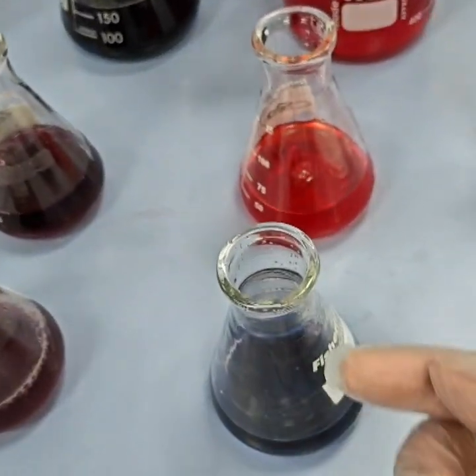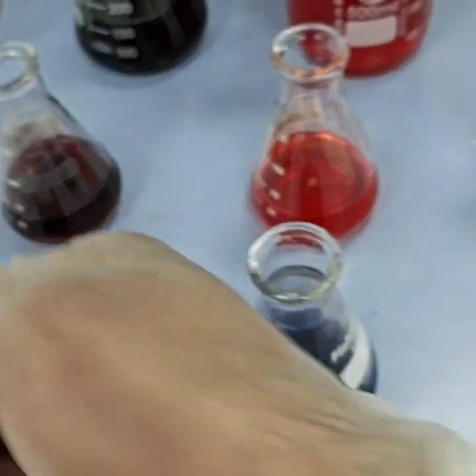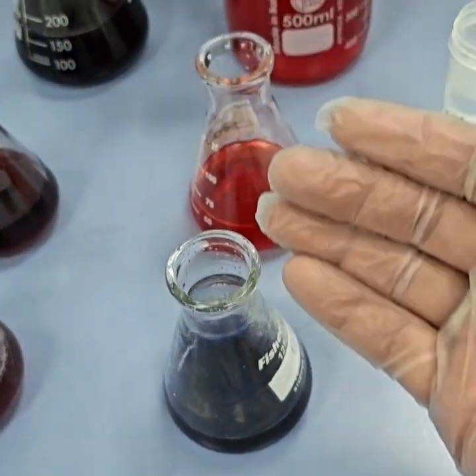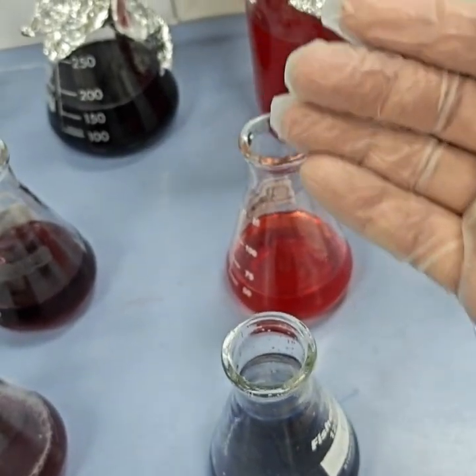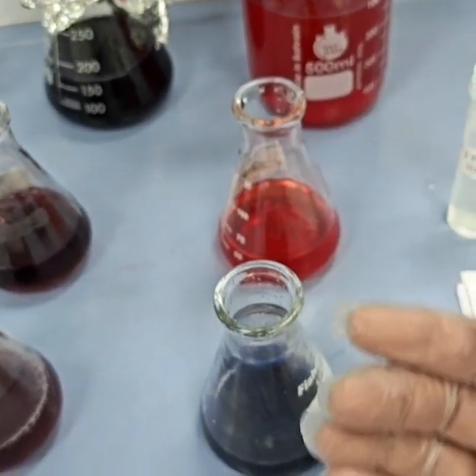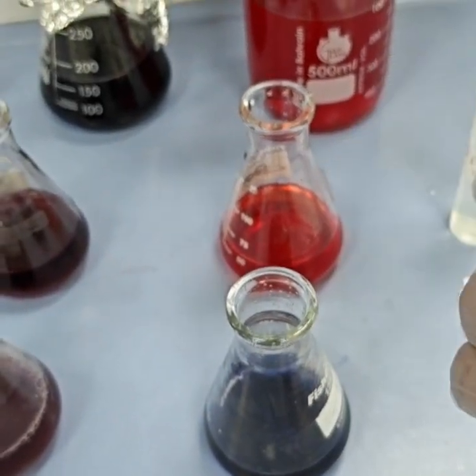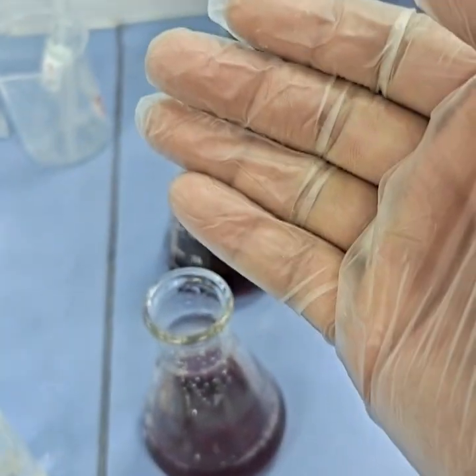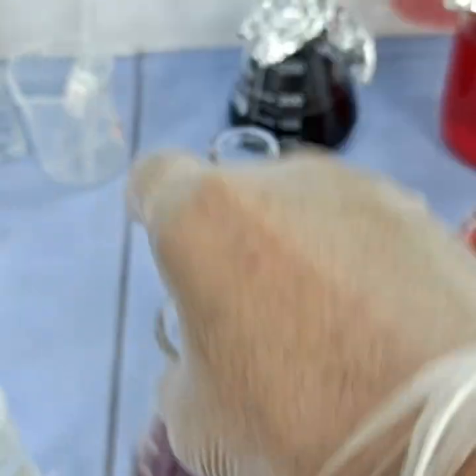You can see that in a highly acidic medium, in the case of Congo red, an anionic dye, and EBT also, there is a shift. You can even say there is a shift of lambda max, a spectrum shift, or we can verify this with the help of UV. I will show you shortly. You can see here this also and this also.